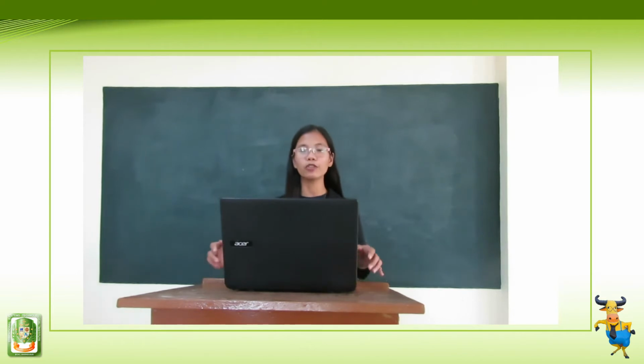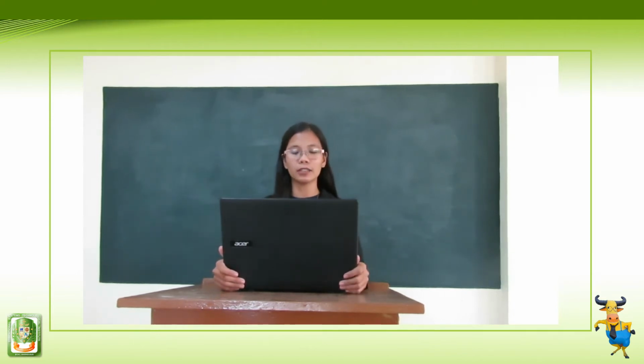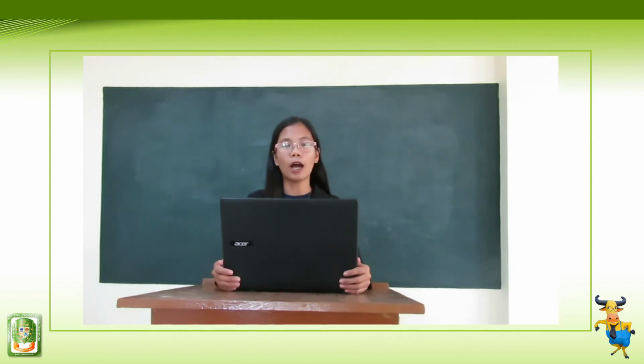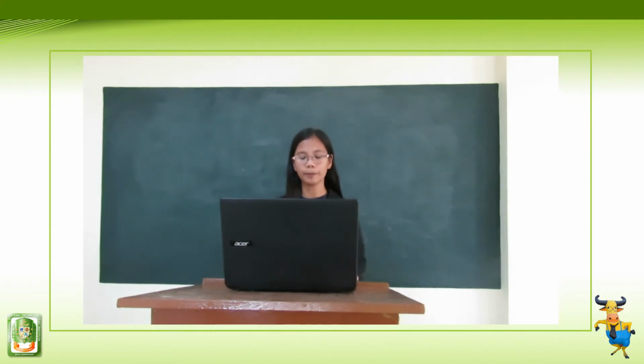So are you all ready to explore the majestic and interesting world of science? Let us start with our first lesson. To begin with, let us first define a microscope. A microscope is a tool which can help you see tiny objects and living organisms. I hope most of you have already seen a microscope.